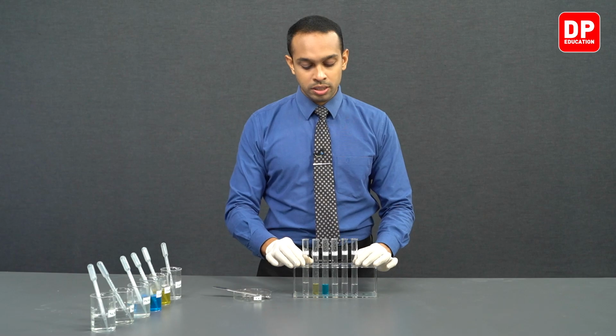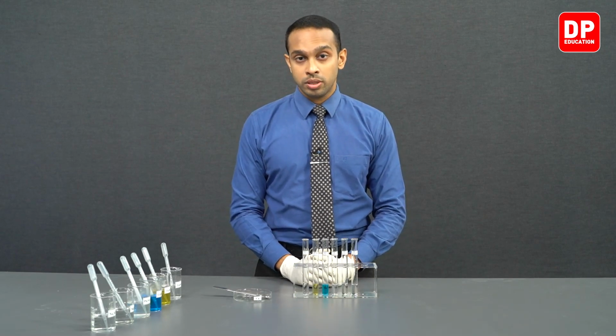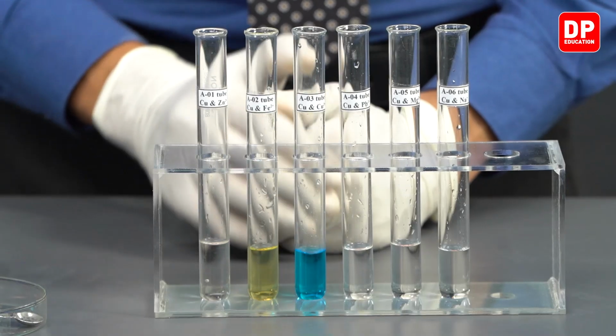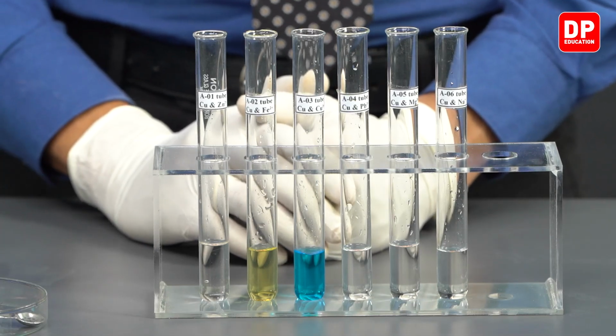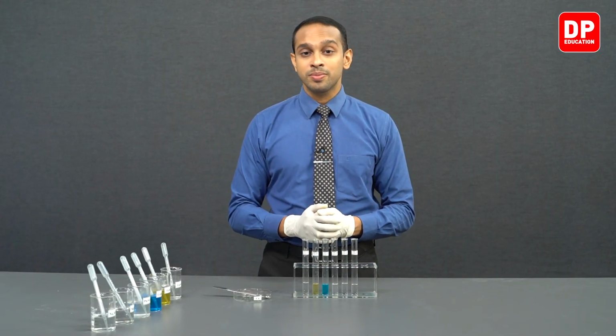Now students, what does this communicate to us? So we can conclude after observing these observations that copper metal was not reactive enough compared to all of these metal ions or metals. Copper metal was not reactive enough to displace any of these metal ions as they are metal.